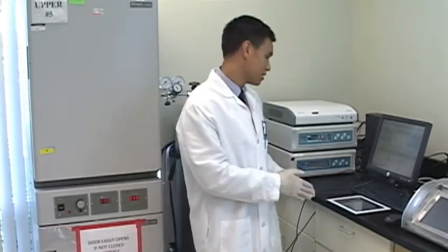The second thing to note is if you are going to be doing a media exchange, then you would simply have to add one step in the procedure to take your E-plate out, change the media in the E-plate, put it back, and then monitor it if you want to establish another baseline. But in our case, we're not going to be performing a media exchange, and so we'll just be adding the compounds directly to cells in growth media.